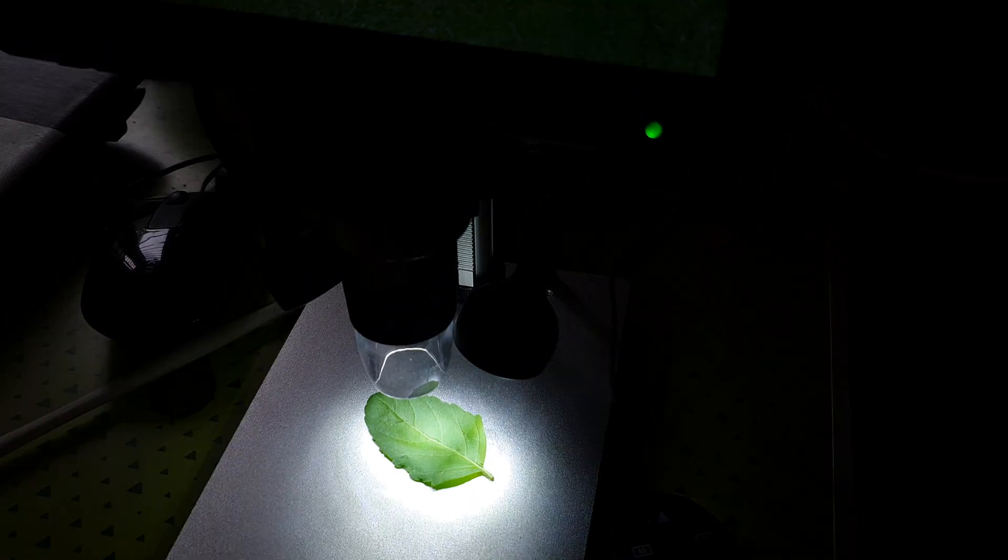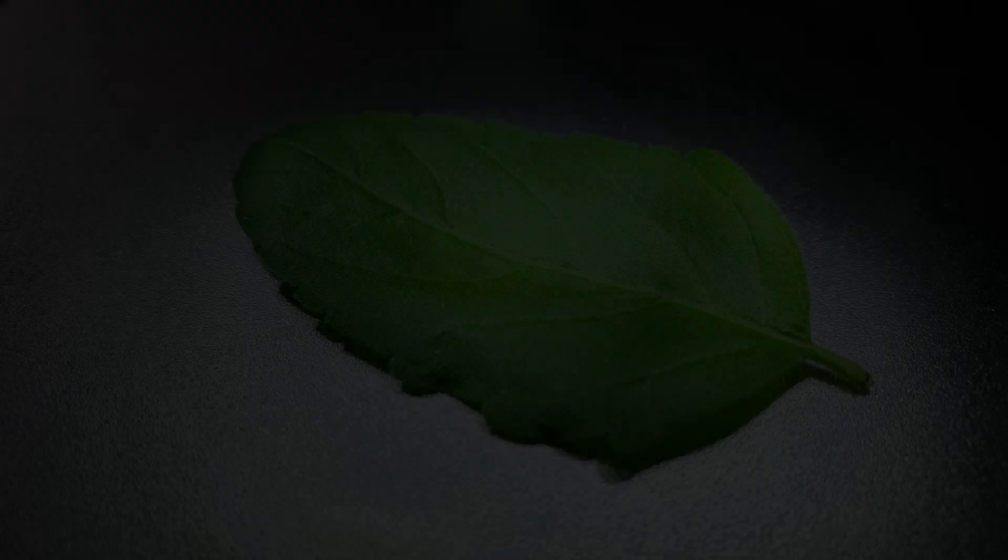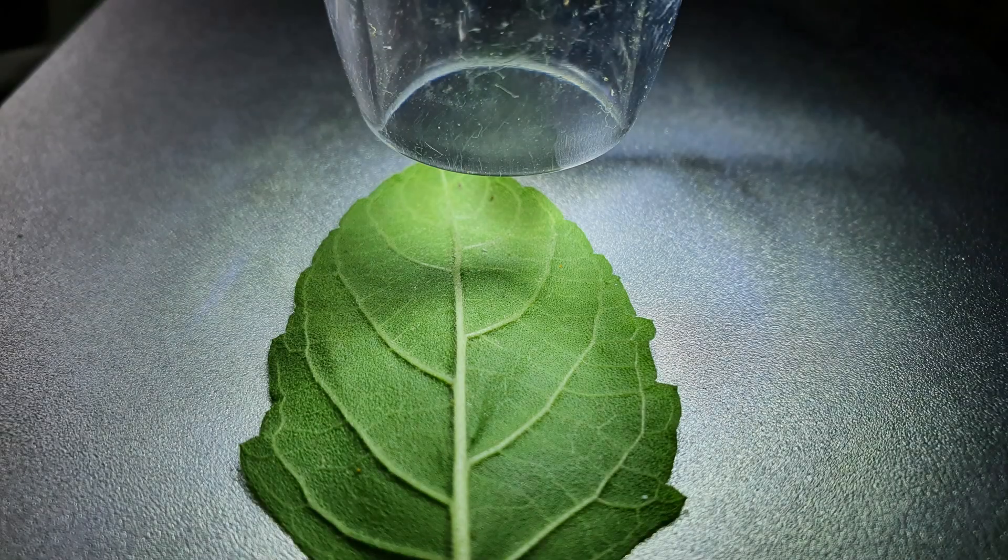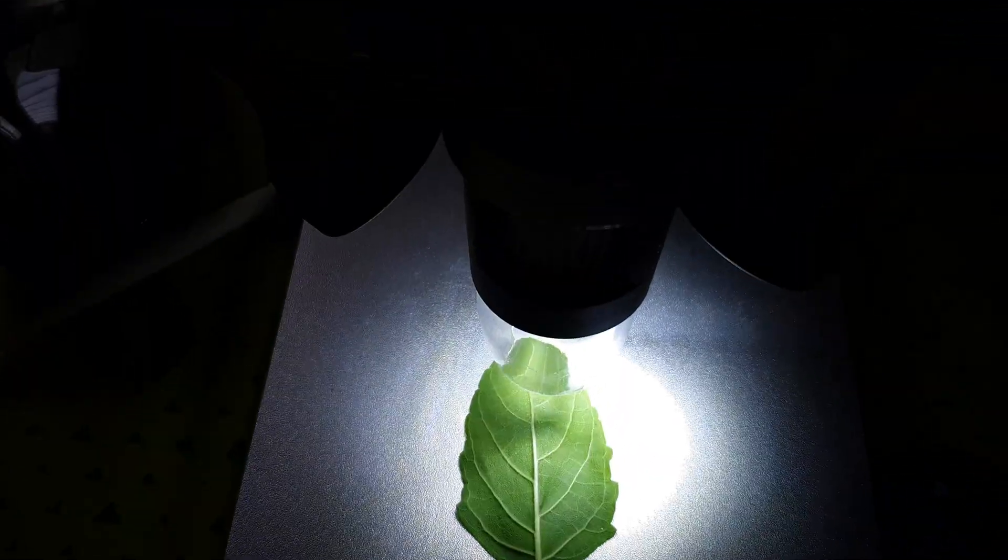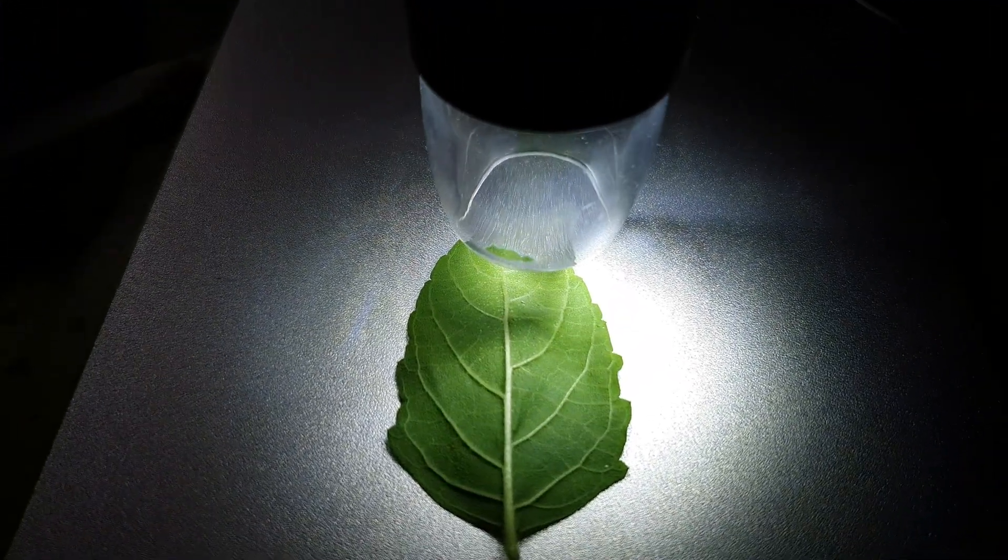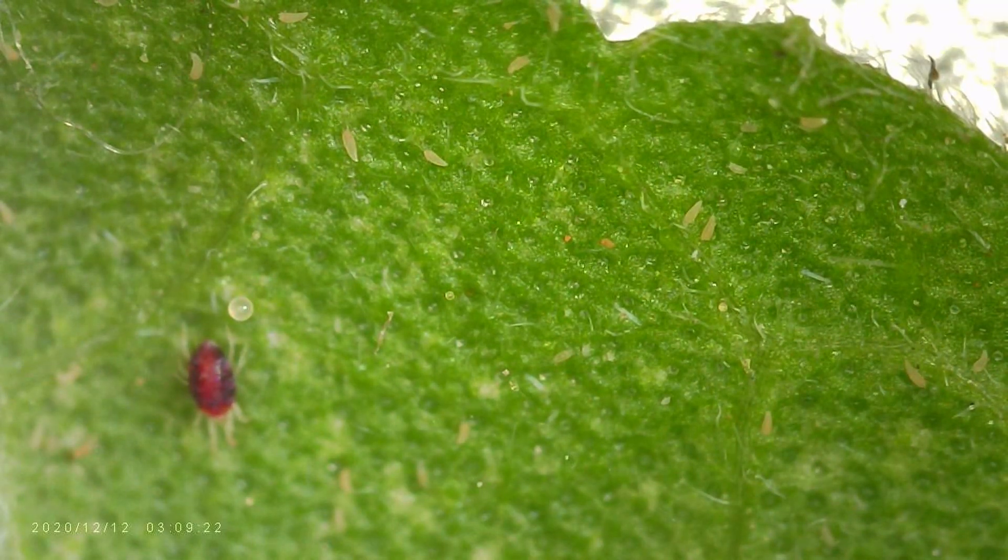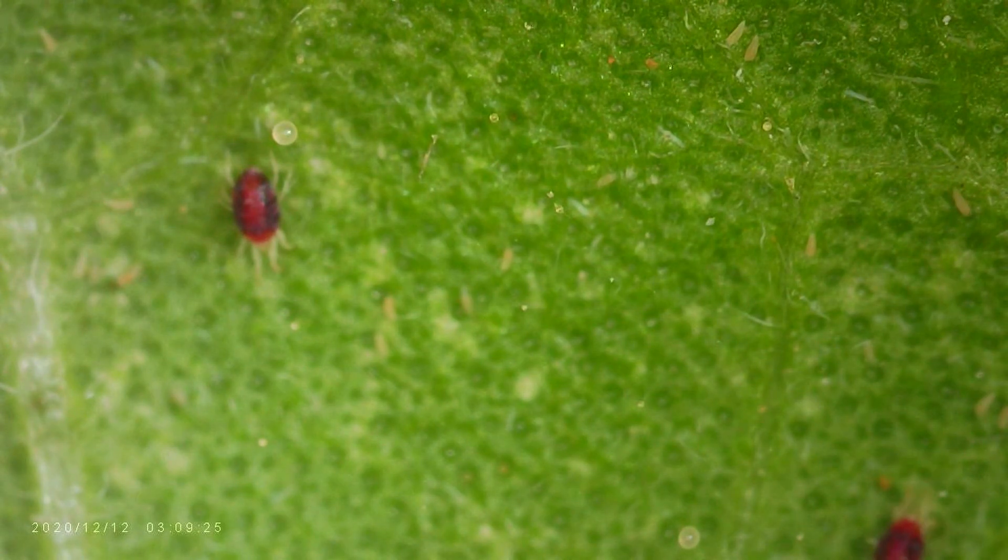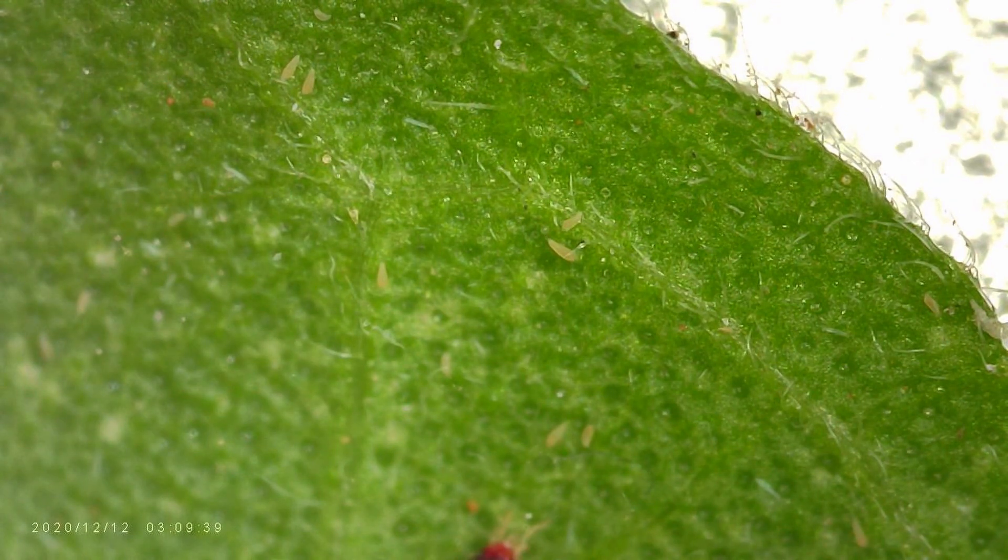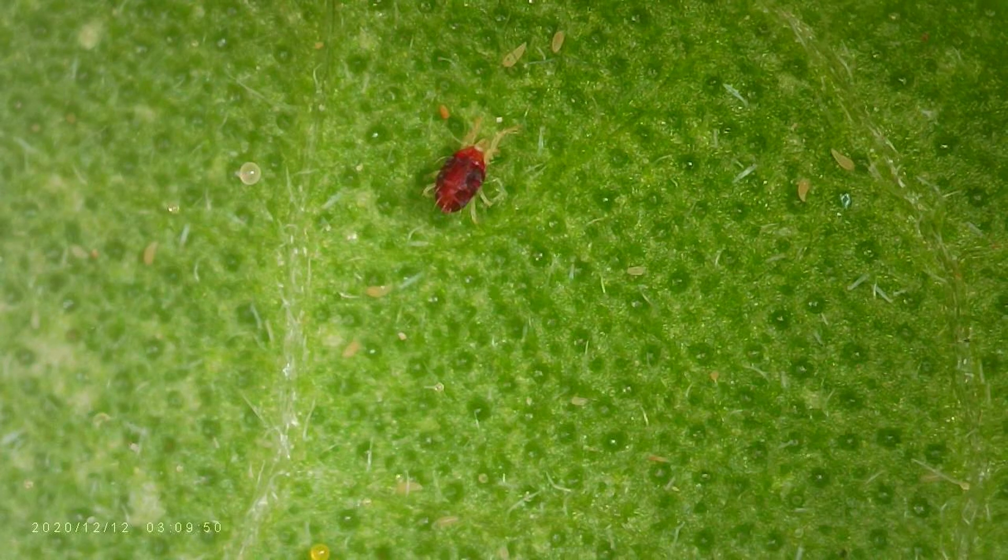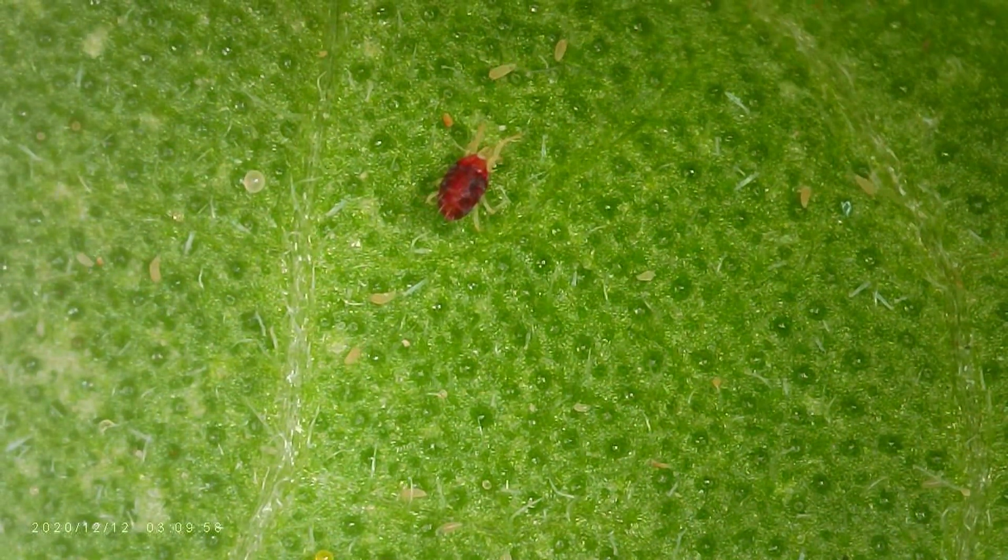I just took it up a level higher. I just put a leaf here thinking that this is all I can see. But then this is what I could see with my phone or my camera. When I actually took this closer and focused on this item I could actually see stuff moving on the leaf. Believe it or not there's a whole ecosystem on this leaf which I wasn't aware of. I don't know what these red bugs are but they're really not visible when I see them directly on the leaf. There are also some yellow stuff there which are moving, some sort of larvae, and you can also see some brown stuff there. I think those are eggs and they're actually stuck behind the leaf and there's no way you can see it with your naked eye.